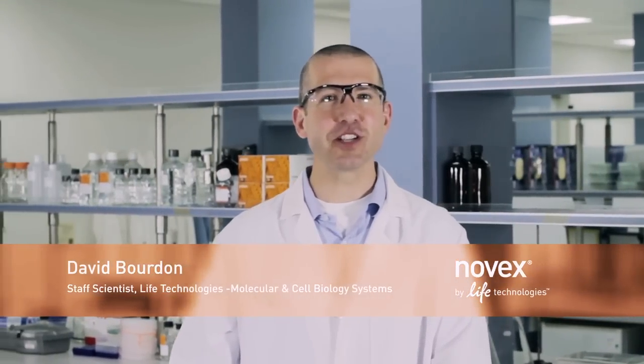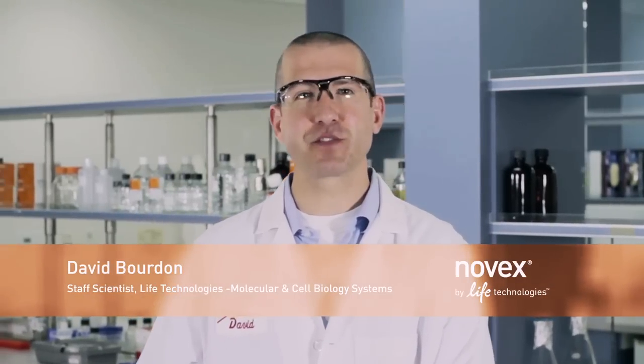Are you performing western blots? Are you running precast protein gels? If so, take a look at the new Novex Bolt Gels and Bolt Electrophoresis Tank.